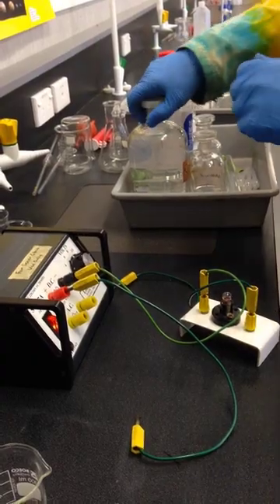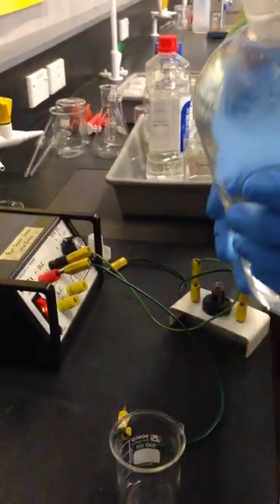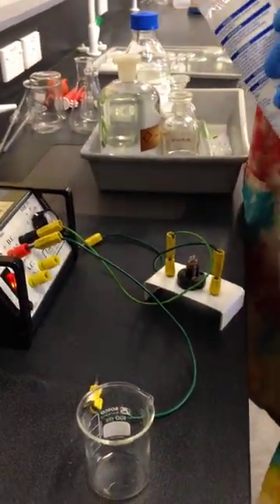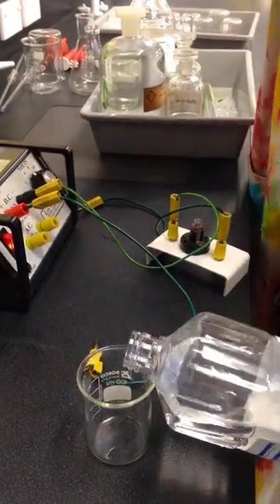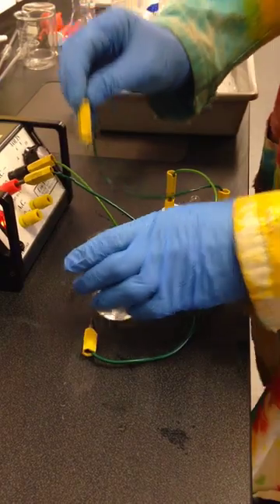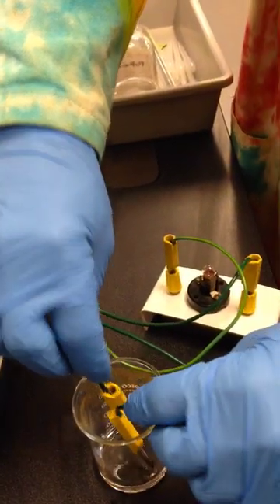The hexane, I've had that one already. Do the turpentine. So turpentine, again, no light bulb going, no electrical conductivity.